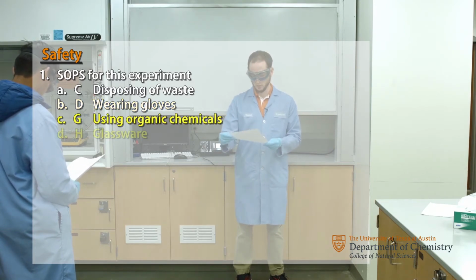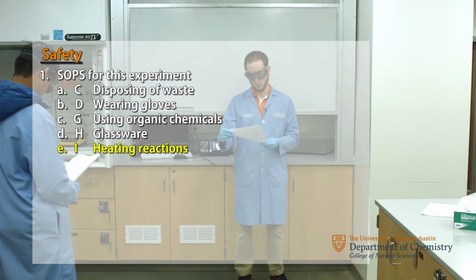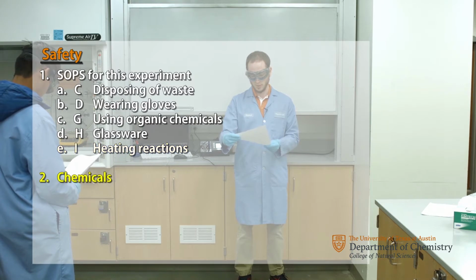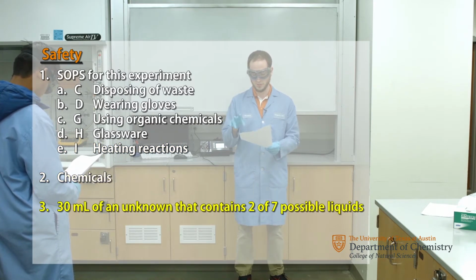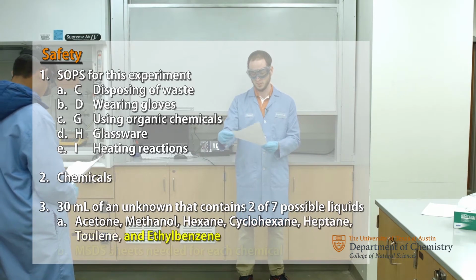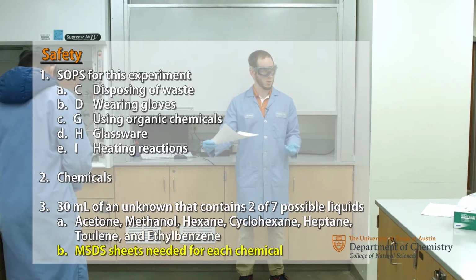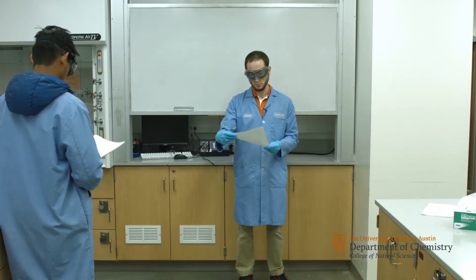Using organic chemicals, glassware, heating reactions, standard operating procedure must be followed for all of those elements. The chemicals that you'll be handling in this lab, you're going to get an unknown liquid sample that contains 2 of the following 7 possible liquids: acetone, methanol, hexane, cyclohexane, heptane, toluene, and ethylbenzene. There's an MSDS sheet associated with each one of those chemicals, so make sure you know the safety hazards associated with each one.